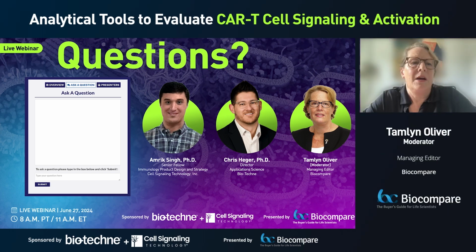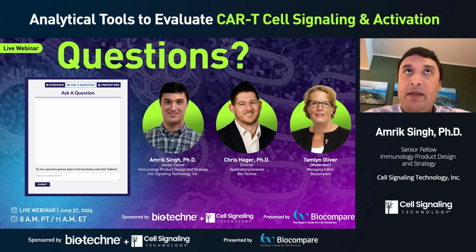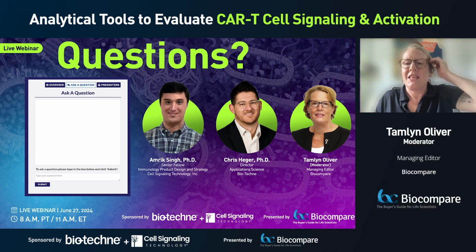All right, thank you. Next question. If the CAR19 is engaged with a CD19 on a target cell, will the anti-linker antibody still bind? That is a great question and something we have not thoroughly investigated as yet. But it's a great question and something that we plan to do.